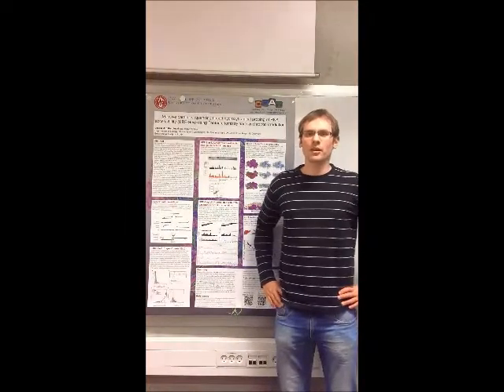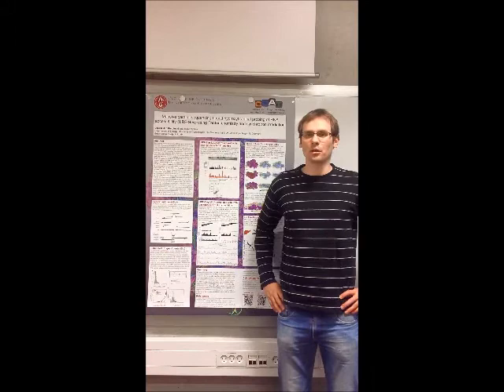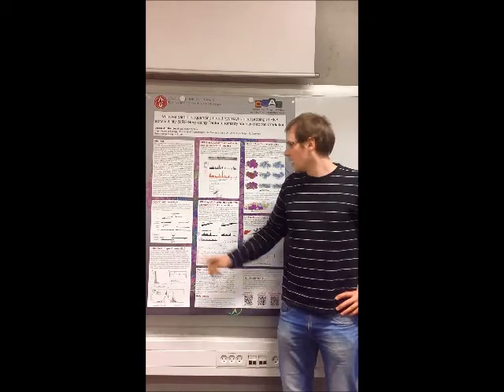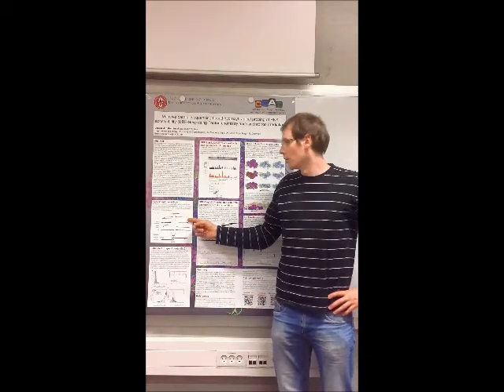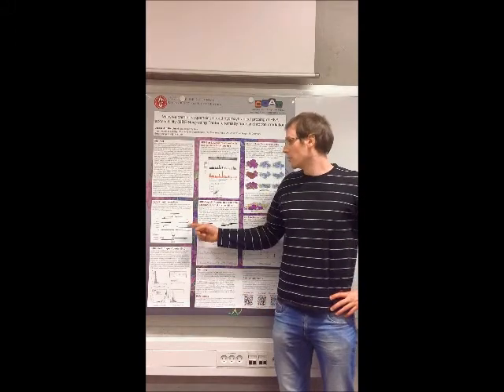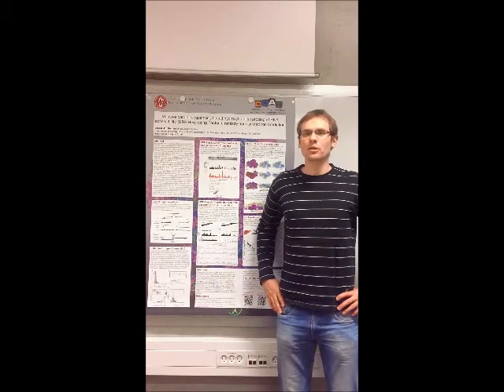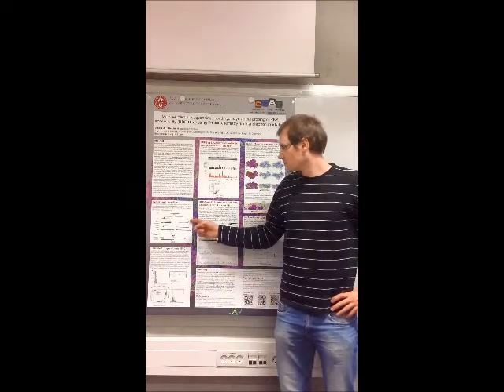The HRF-Seq experiment starts with RNA probing with hydroxyl radicals and keeping the untreated control. Both samples are subsequently reverse transcribed with random primers harboring the Illumina adapter overhang.